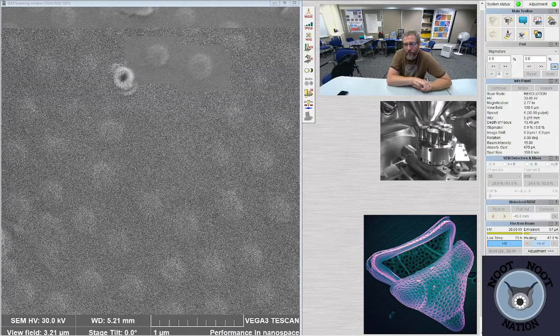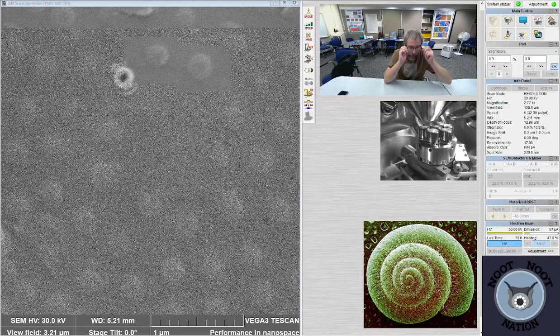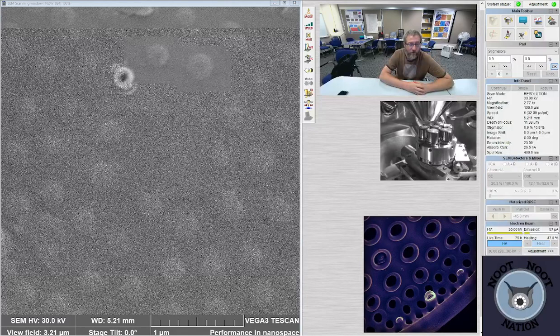So the first thing I did was make some adjustments to the wobble. And the second thing I did was make some adjustments to the stigmation. Just like putting glasses on a person that's got astigmatism, it basically puts glasses on the SEM using the magnets and rearranging it so that the beam is focused directly on the surface. The better your stigmation is, the better your image is. So it's usually where a lot of my effort goes when I'm trying to get things in focus perfectly.